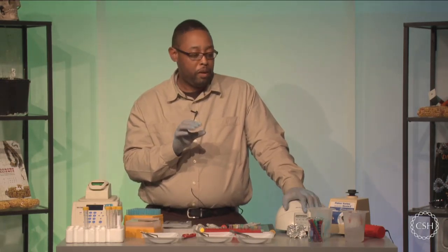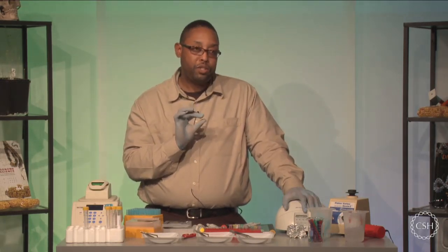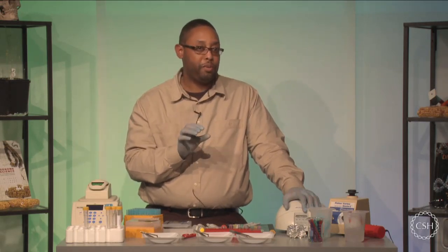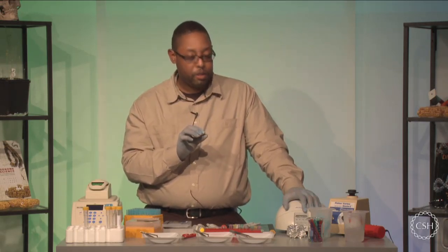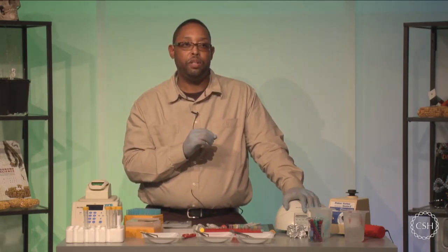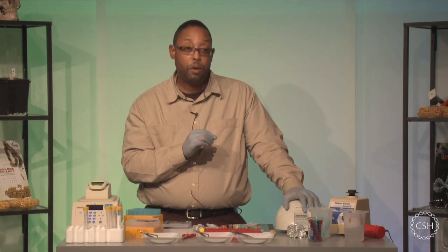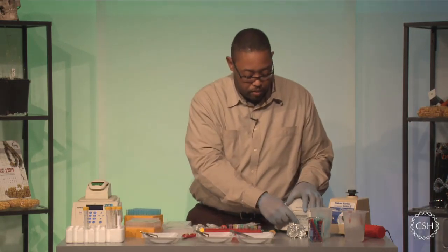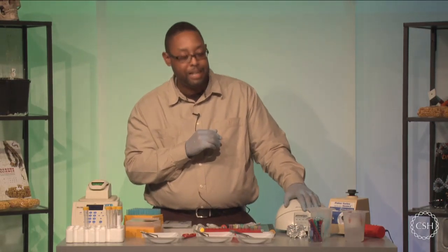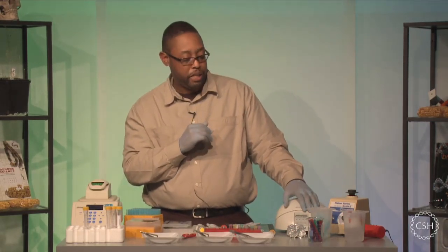Okay. Now, we don't want to let the pellet dry too long. I would not let this dry more than about 2 to 3 minutes max, to ensure that you don't over dry the pellet and don't allow for DNA to be fully eluted off of the resin. So what we're going to do is stop this, just making sure we have enough time so that all the silica resin is attached very well to the bottom of the test tube.